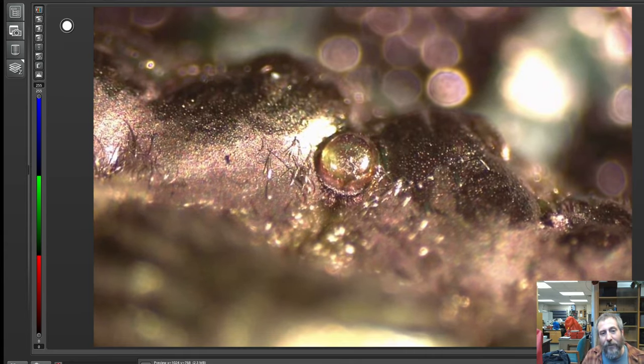And then the eyes that are on the side, the compound eyes, are used for motion. So they can basically gauge things, but they're wired pretty differently than we are, because it's thousands of little facets on their compound eyes. And then these big eyes are really simple. Usually they're red, and on these cicada, I'm pretty sure they are still red. But I think that they're used mostly for detecting light. So yeah.